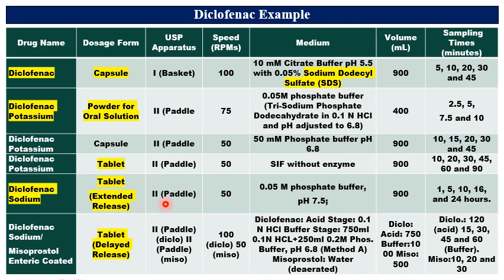Then diclofenac sodium extended release tablet is also available. That has a dissolution apparatus of paddle at 50 rpm, then a medium of pH 7.5 and an extended release profile of 24 hours. That's why it is a different dissolution condition. Then diclofenac sodium and misoprostol enteric coated tablets are there. These are delayed release tablets. That's why a delayed release dissolution requirement is there, and based on that the dissolution stages are there, the acid stage and the buffer stage.